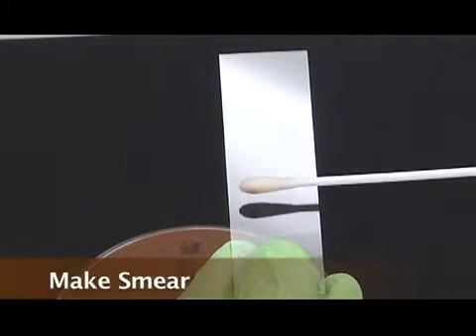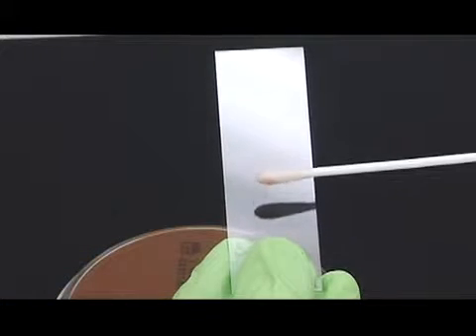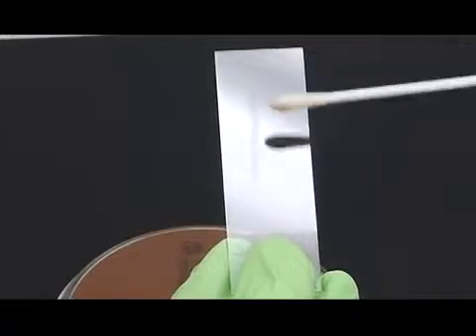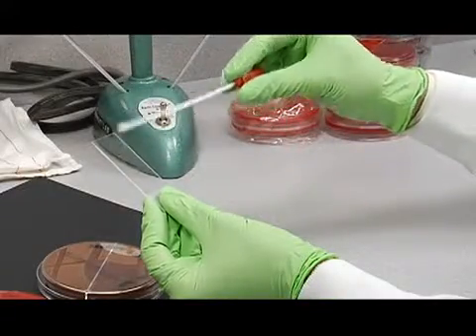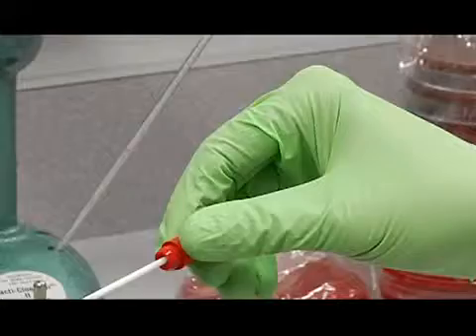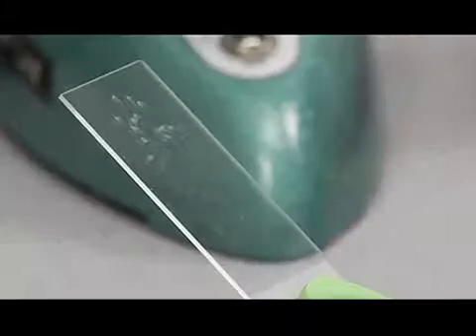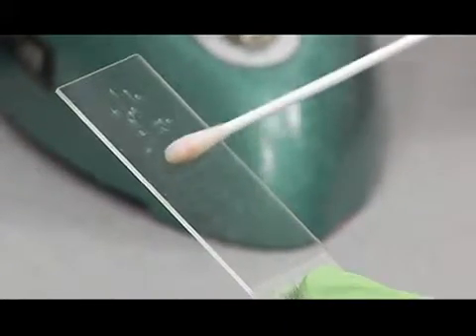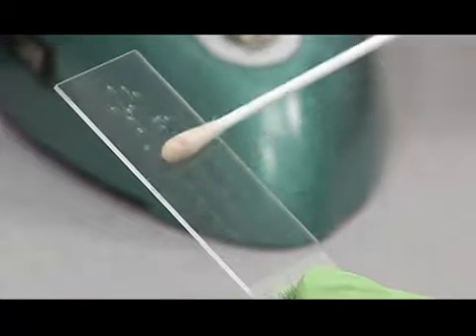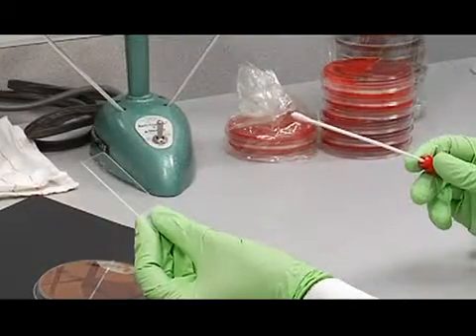And then you're going to make your smear. You want to gently layer the material onto the slide by rolling your swab towards you as you move it away on the slide. And you don't want to do this because you can destroy your cells and your morphology. So you want to do that until you can see some material dried on the slide. And that looks pretty good. I can see some material on here pretty easily.